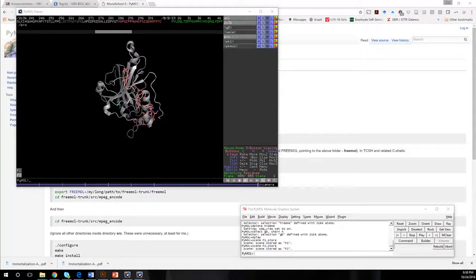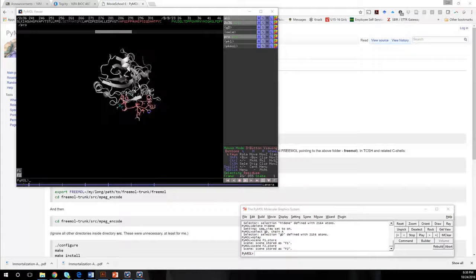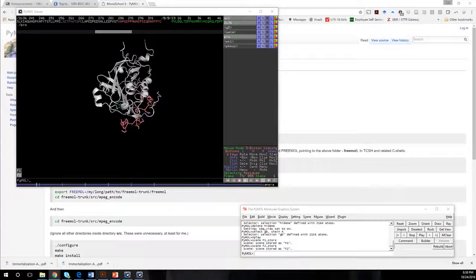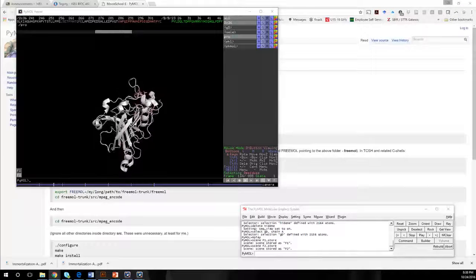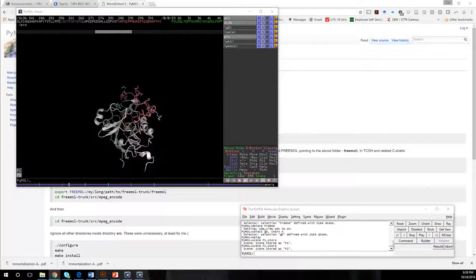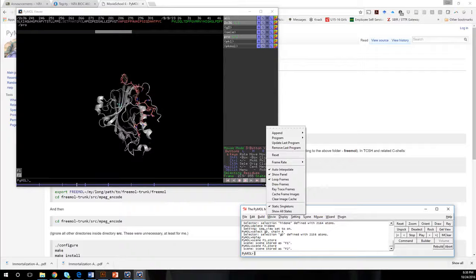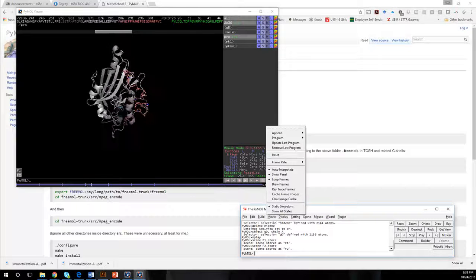I can export really quickly, as I mentioned, if I look at movie school number 6, there's options to do that. So it teaches you right there how to do that. Maybe I'll do that in the next one.